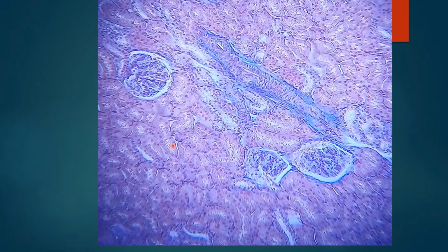Here again in these areas you can see the distal and proximal convoluted tubules, and this one is the distal convoluted tubule. This is an obliquely cut section of some of the descending tubule, maybe, and this one is also a collecting duct.